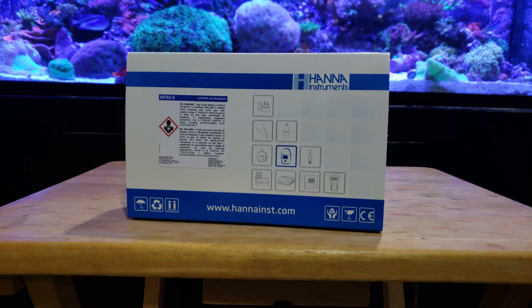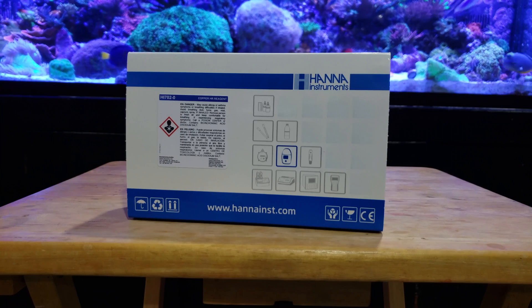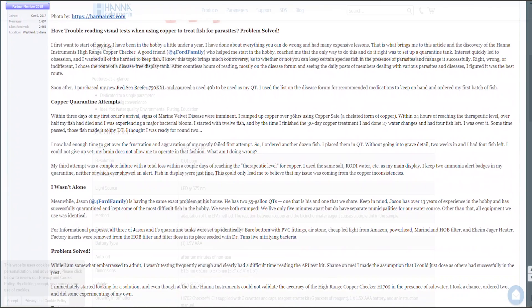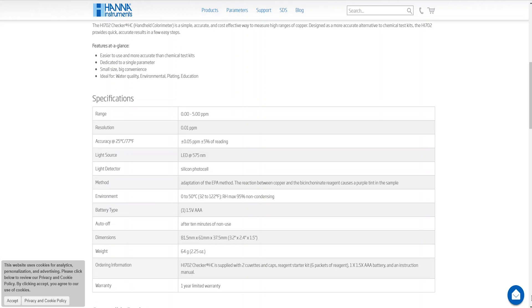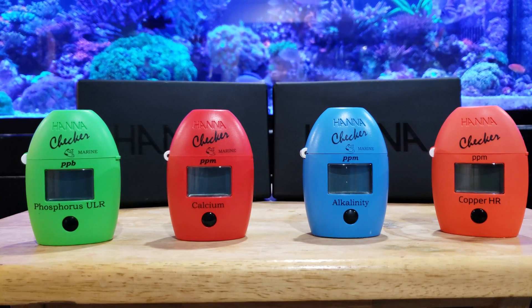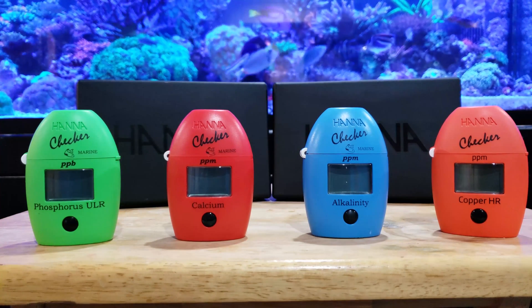Today I've received my new Hanna Copper Meter from BRS. I'm just taking it out of the box — this will be the first time I've ever used this meter. I want to send a shout out to Reef2Reef and to Hanna for making this meter possible. I believe this will make quarantine a lot easier for a lot of people. The Hanna High Range Color Meter, the HI-702, has a range of 0 to 5 ppm and is accurate to plus or minus 0.05 ppm — it's a very accurate meter. If you're familiar with Hanna, you probably already have the alkalinity meter and either the phosphate or phosphorus meters. I use those all the time and I can't wait to start using this.